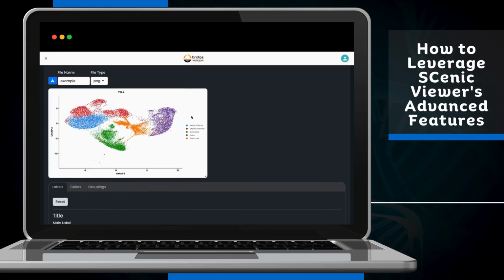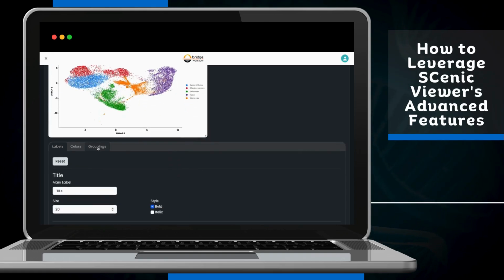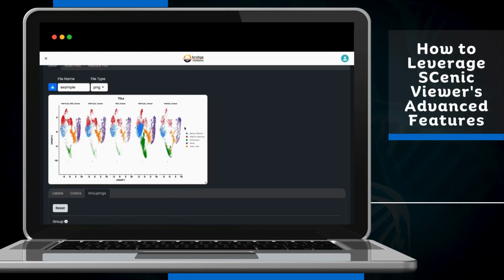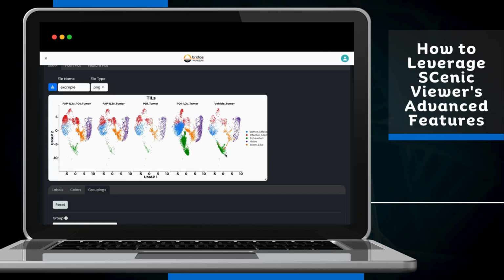One of the really cool features in SCenic Viewer is the ability to split your UMAP plot based upon the different treatment statuses or different conditions that may exist within your Seurat object. So let's say for this given data set, if you wanted to visualize how your UMAP looks with different treatment statuses, you can simply go within the Groupings tab, and under your treatment split, you can select Treatment, which will split your UMAP plot by the different treatment statuses. So once again, you can simply click the bottom right hand corner and drag your plot to resize.